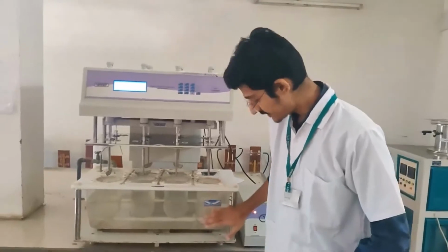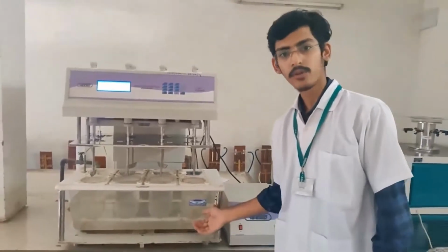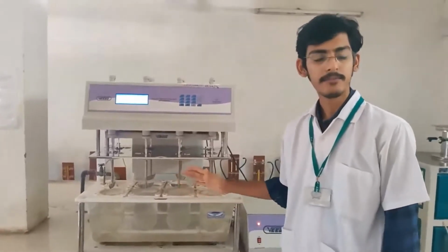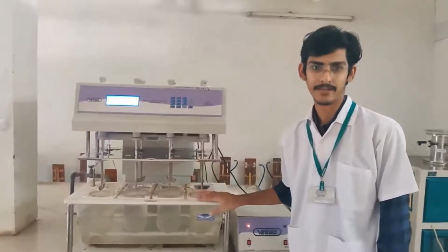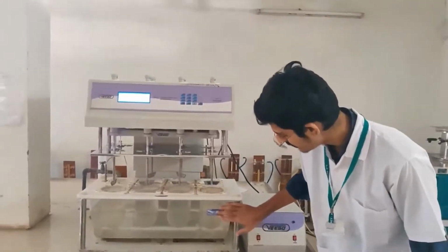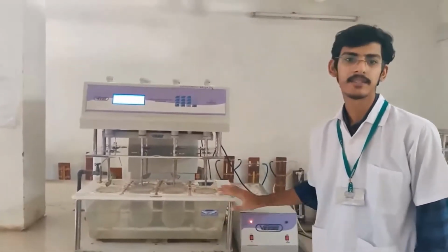This is the water holding system in which we fill the water up to the pump level shown on the apparatus. There is a heating rod which is dipped into the water to maintain the temperature. After that, we have our graduated vessel in which we fill the dissolution media as specified.